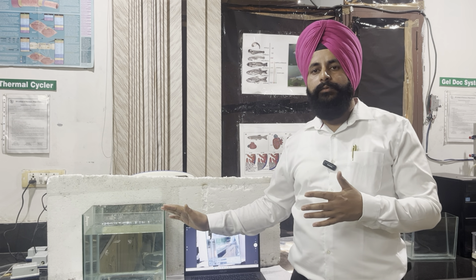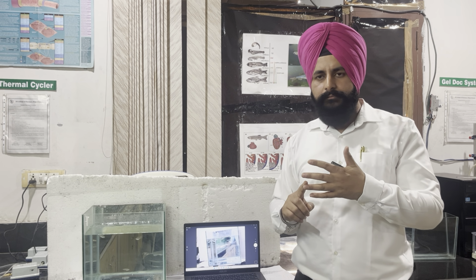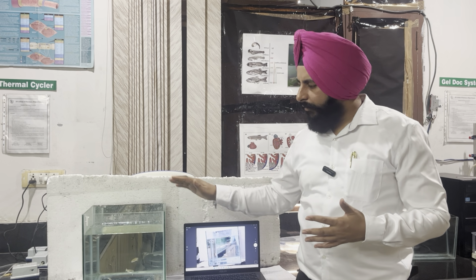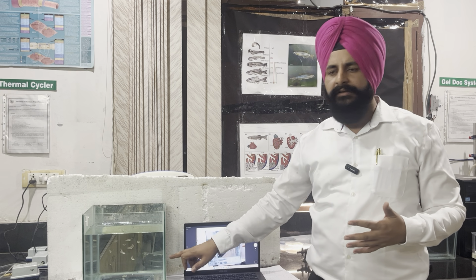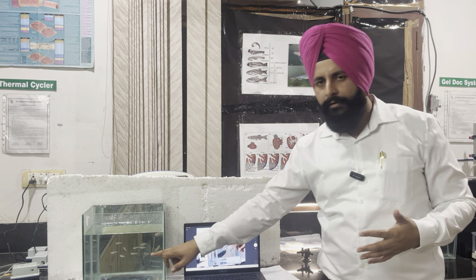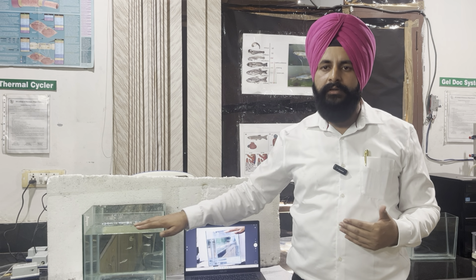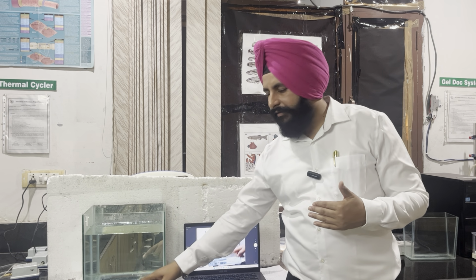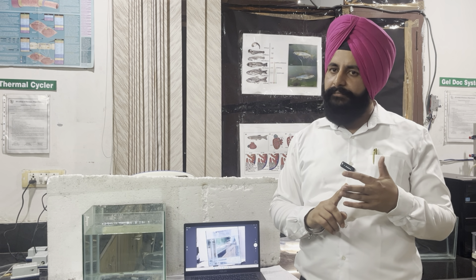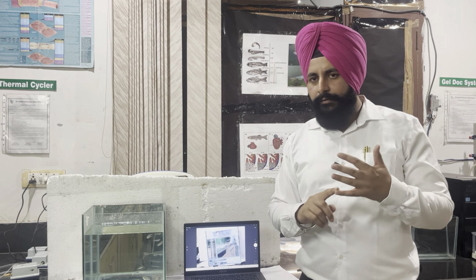What parameters will you check for analyzing the level of anxiety? First thing, you will check the movement of the fish. You will divide this box into two zones, drawing one line, and you will check how much time the fish stays in the upper zone. Basically, in case of anxiety, the fish will spend more time in the bottom zone. That is the first parameter you will calculate. For how long? For 3 to 5 minutes you will calculate the time spent in the bottom zone.